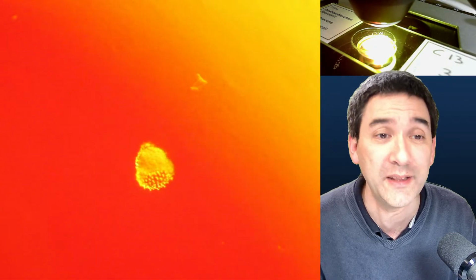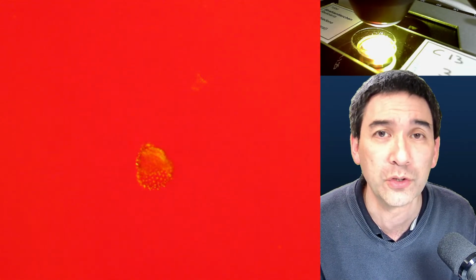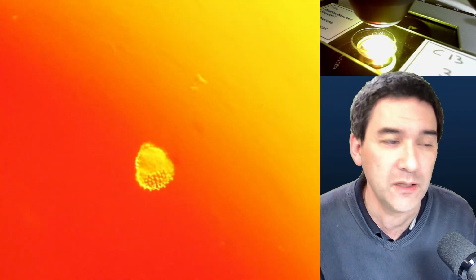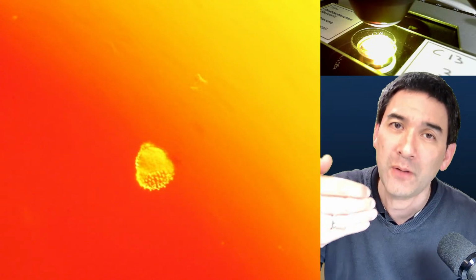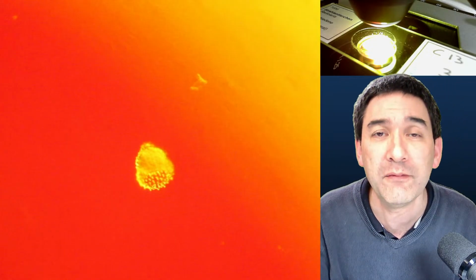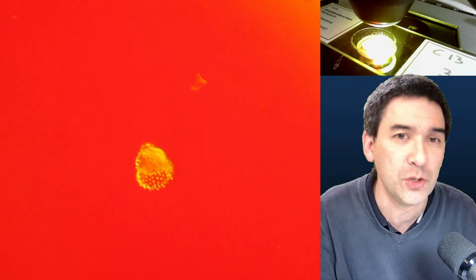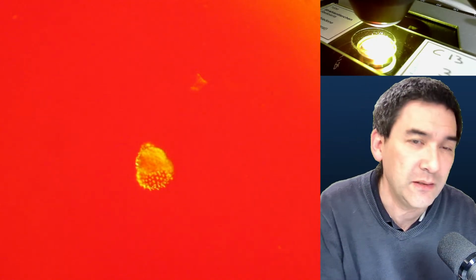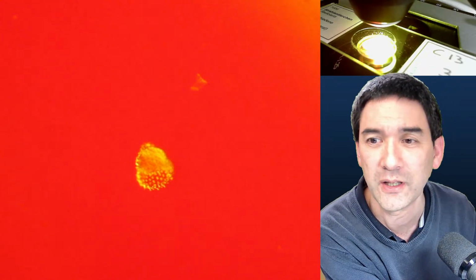But I've not tried that because I don't have those separate retardation plates. They're called that because they're retarding or shifting the electrical and magnetical field of a light wave by a quarter of a wavelength, and then you can get the color changes.